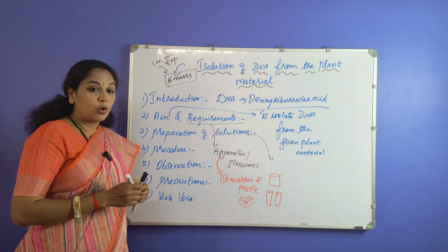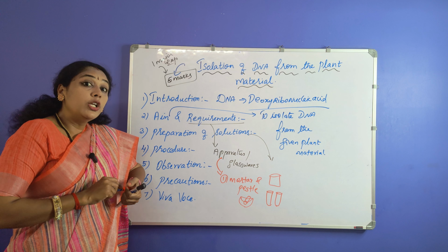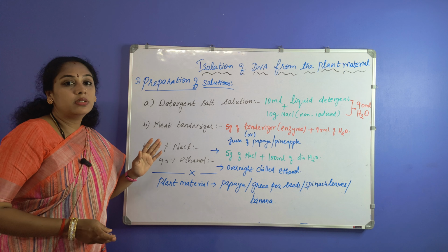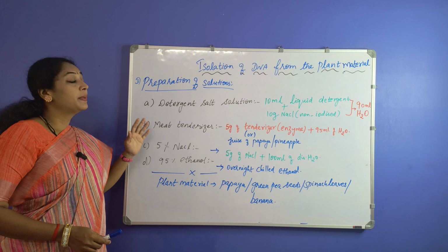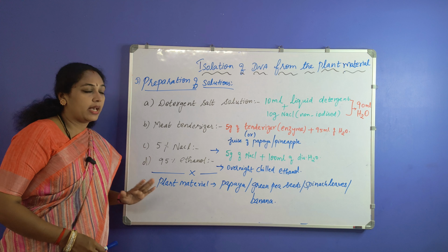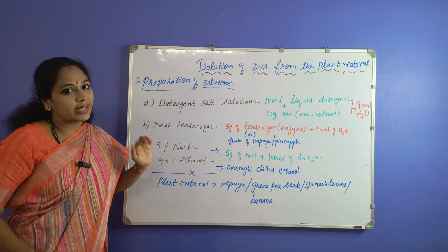Then we will discuss the solutions. So what are the solutions required for doing this experiment? Now the next thing we are going to see is the preparation of solutions that are required for the isolation of DNA.